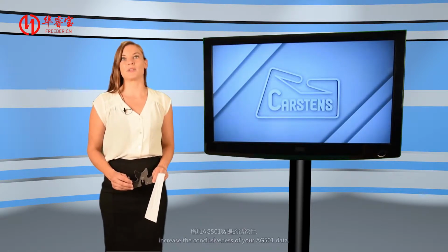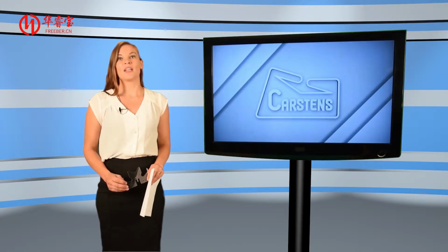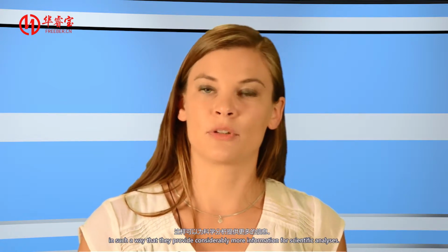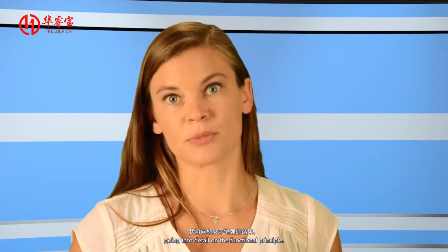My name is Julia and I'd like to show you how to considerably increase the conclusiveness of your AG501 measurement data. This does not require any modification of your AG501. This simple BitePlane can enhance your AG501 measurement data in such a way that it provides considerably more information for scientific analyses. I'm going to show you the enhanced results before going into detail on the functional principle.